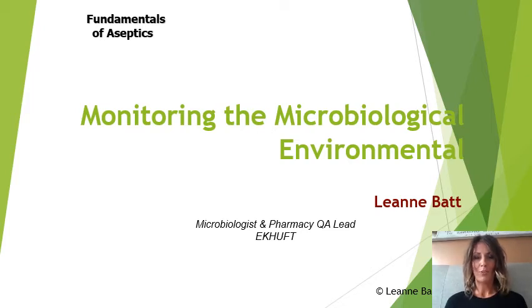I am the Quality Assurance Lead at East Kent Hospitals in the Pharmacy Department. I'm going to be talking to you today about microbiological monitoring of our clean room. To give a bit of background by this point, we know that to make aseptically prepared products, we work in a controlled environment called the clean room. As its namesake suggests, we want to be keeping that environment clean, specifically from microorganisms, as these can lead to product spoilage, but even more detrimentally can cause harm to an immunocompromised patient by causing illness.